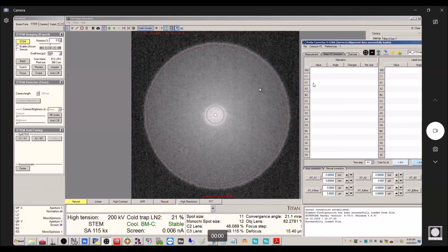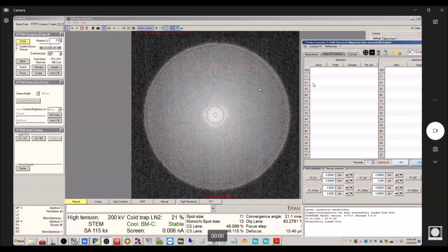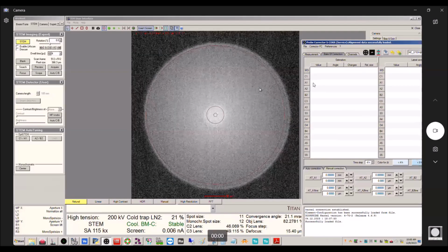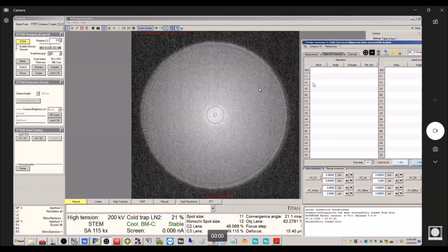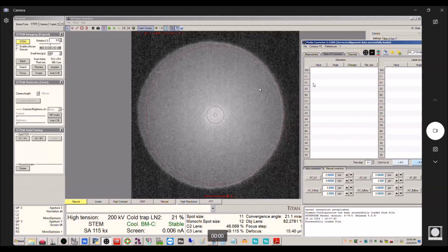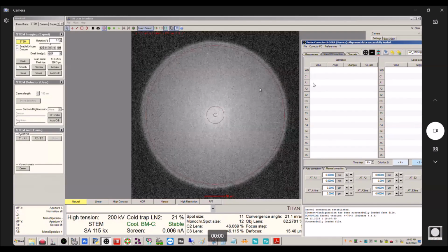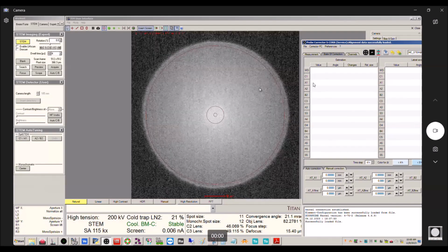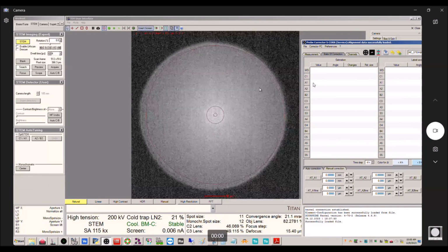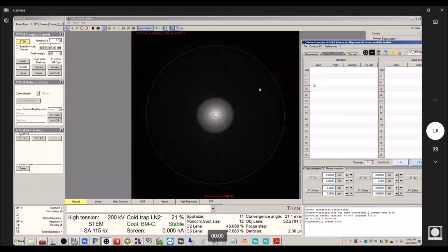See if I can get this just a smidge better. Come on. Okay, that looks pretty good to me.